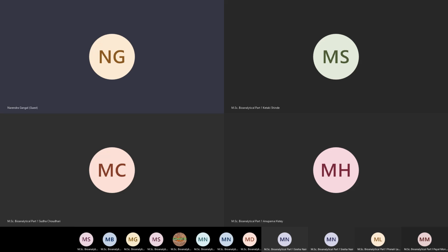My molecule of interest: when one electron is removed, my molecule gains a positive charge. So it is basically the M+ ion, M plus 1. There is no change in the molecular weight, but there is a plus 1 charge which it gets. When I say mass to charge ratio, M is my molecular weight and Z is the charge, that is 1. So that is the ion which represents the molecular weight of that particular unknown species.